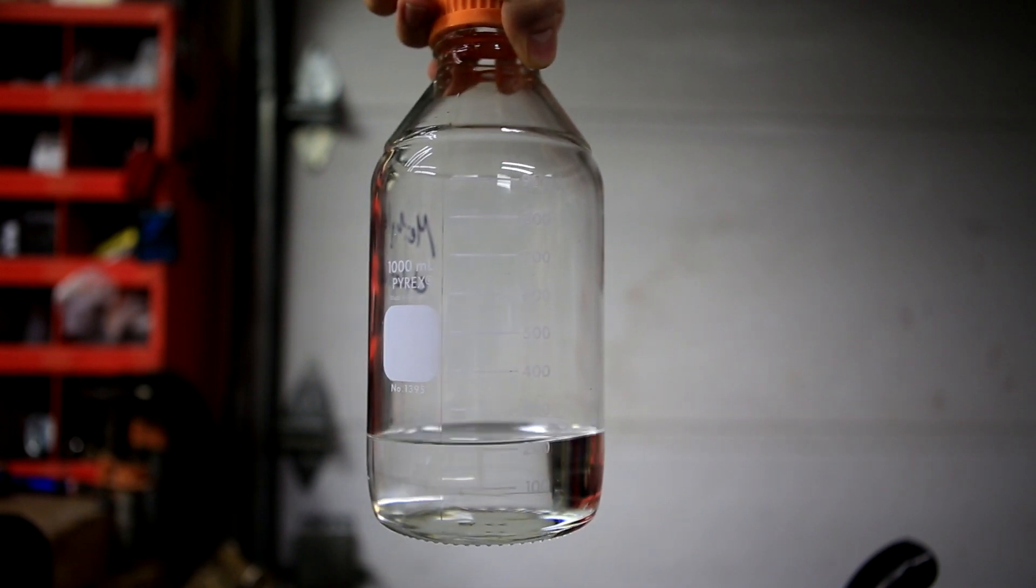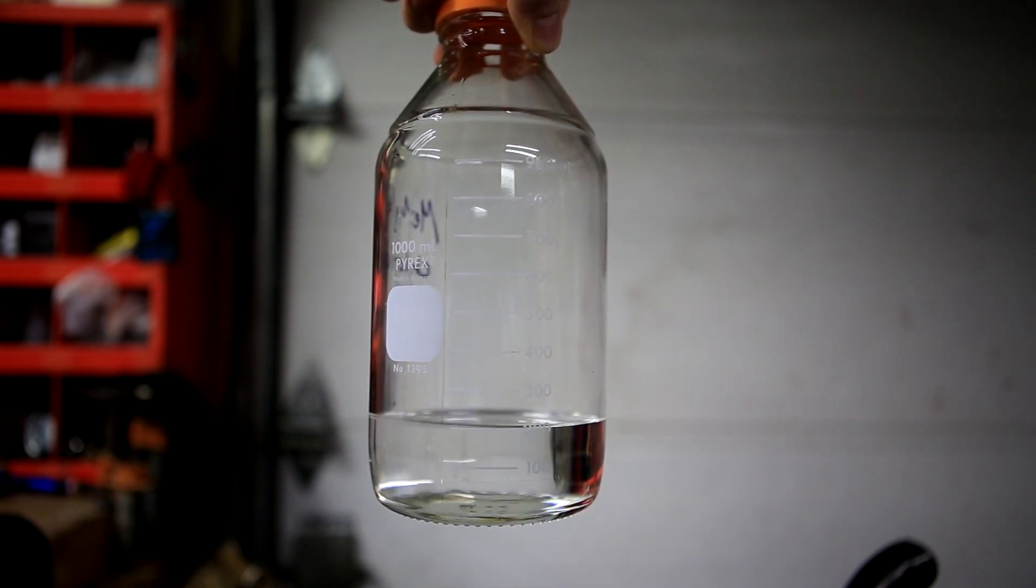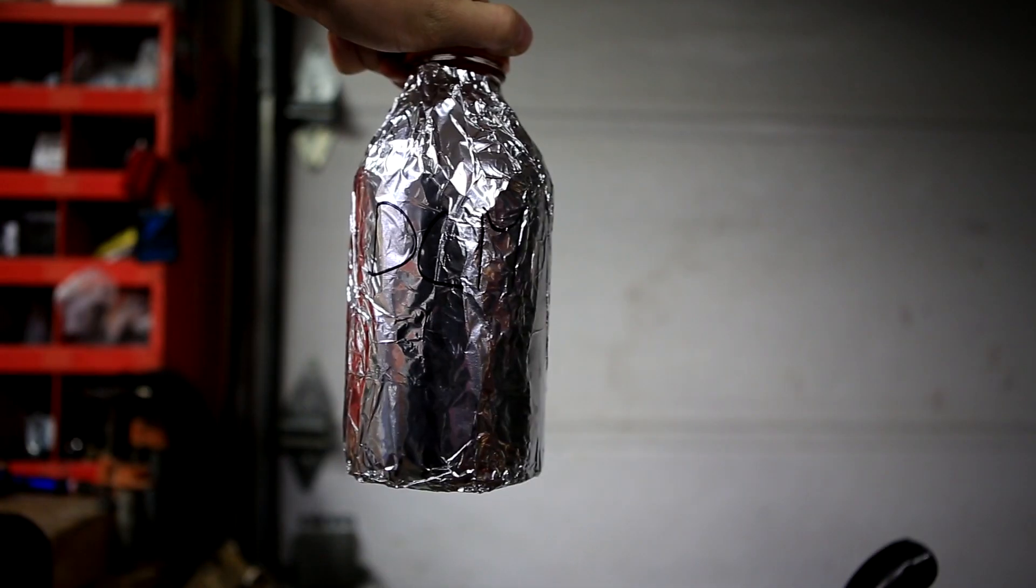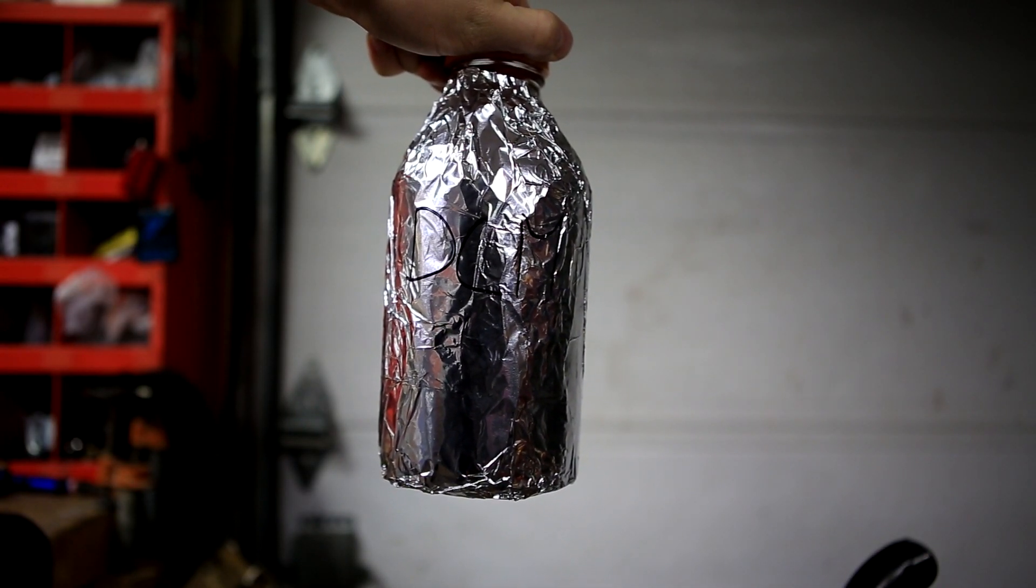In the end, I was left with about 200 ml of nearly methanol-free dichloromethane. The bottle was then wrapped in aluminum foil to protect it from light.